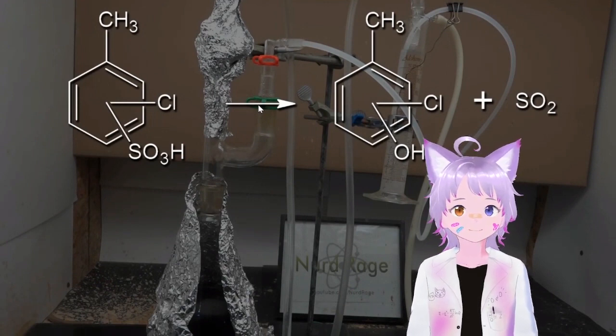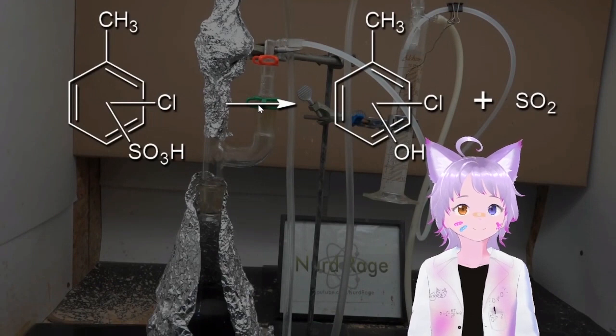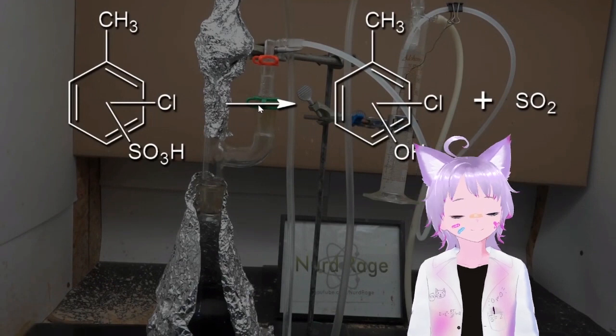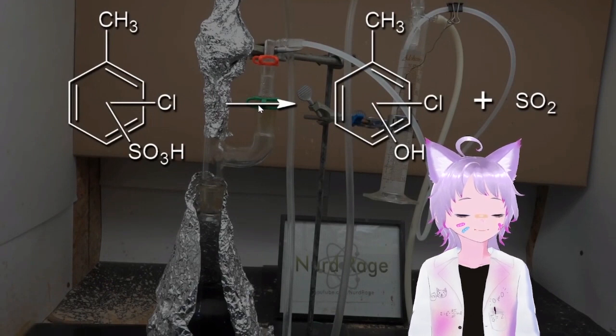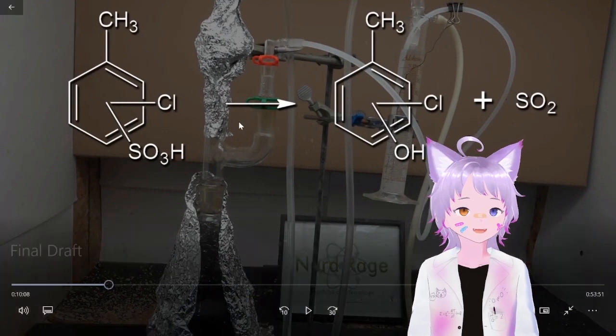As a chemist, you think, yeah, this definitely works. But as a chemical engineer, all of this mass is wasting a lot of thermal energy. Think about it, more heating to get the vapors higher. Therefore, maybe the reason why he is using a 1/10 molar equivalent is because it cooks a little too. He's heating it a little too high.